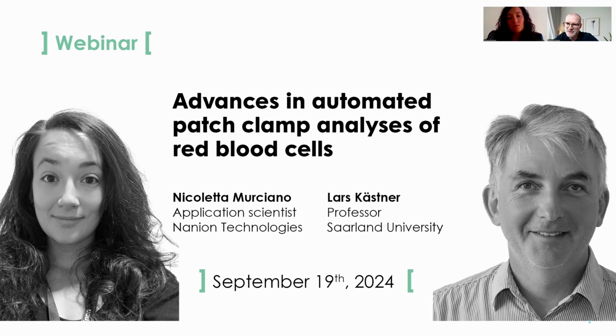And the third question from Michael Netzer: seeing the experiments with sickle cell RBCs, do you think there is a potential for a current clamp assay to measure Gardos channel inhibition? Meaning the hyperpolarization with the MB method, I guess. So when we see that change in the membrane potential, I don't know, I never tried.